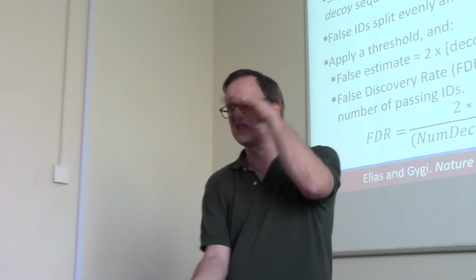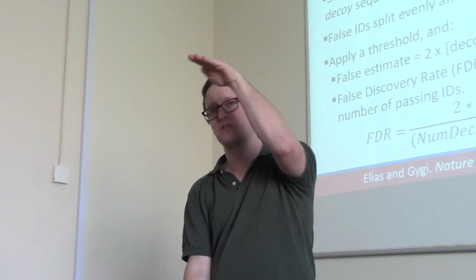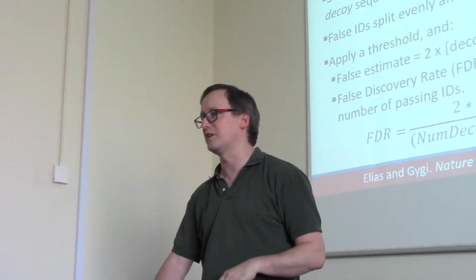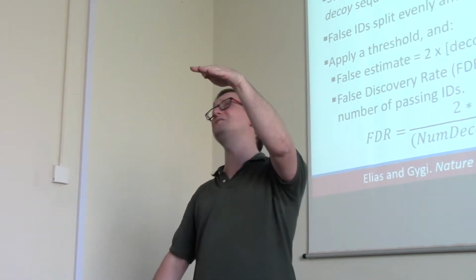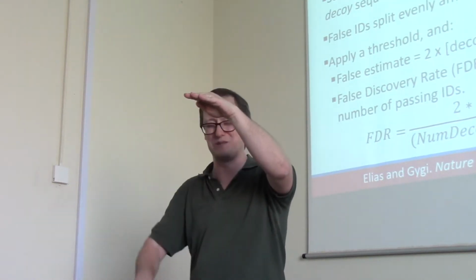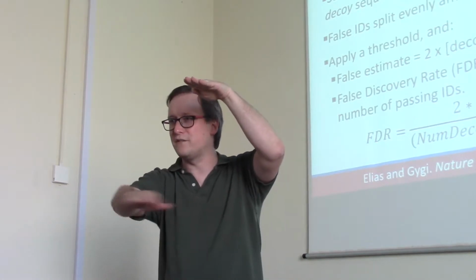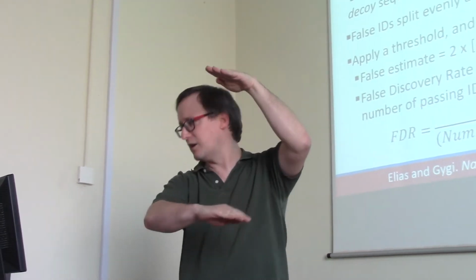Imagine that I have sorted all of the PSMs from a given experiment from best score to worst score. All right, so these ones down at the floor, these are PSMs that matched maybe a couple fragment ions, and that was it. They're lousy. The ones touching my fingertips, though, they're brilliant. 20 matched peaks. A very high signal to noise, my bad. This is grand. So somewhere from brilliance to trash, I have to draw a line. I'm going to try to set a threshold that says this set of peptide spectrum matches are believable.